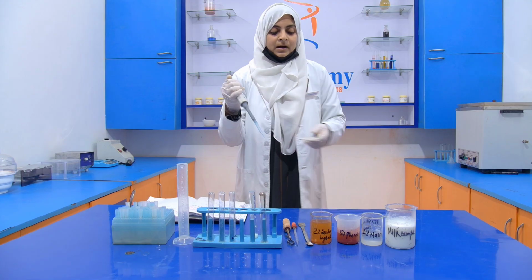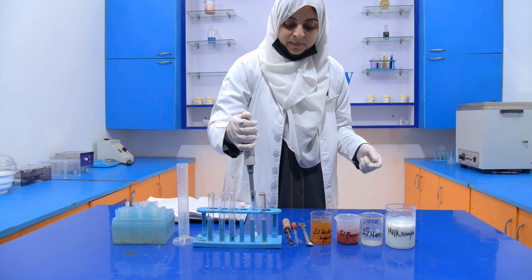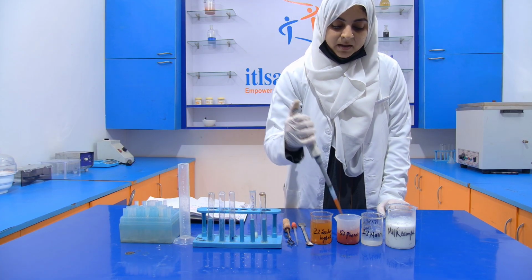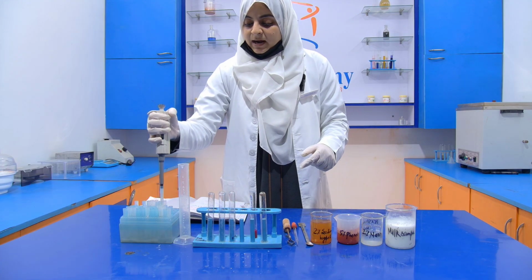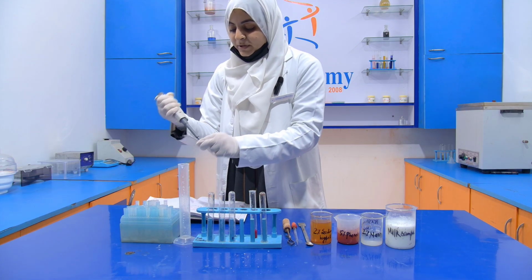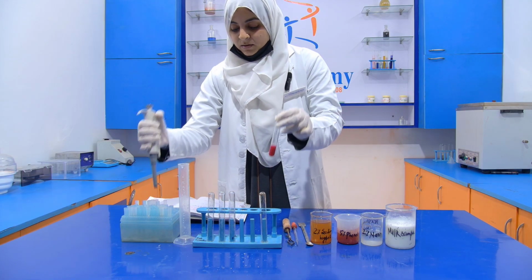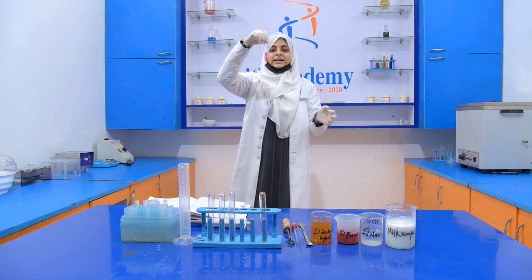So I'm going to take 0.5 ml of sodium hydroxide and add it into the milk. Then we have to take another chemical, that is the phenol. If this pink color turns into blue color, deep blue color, then it means that our sample contains ammonium salt. If this pink color persists, then it means that our sample does not contain ammonium salt.